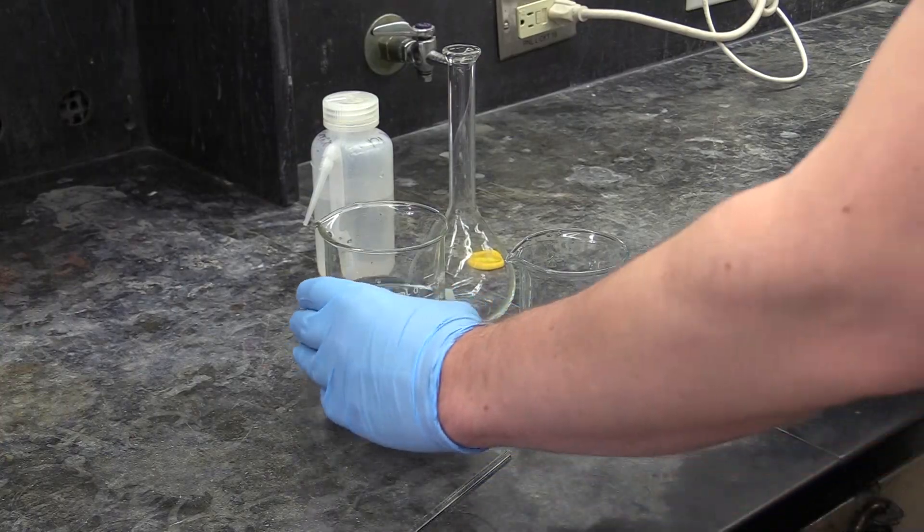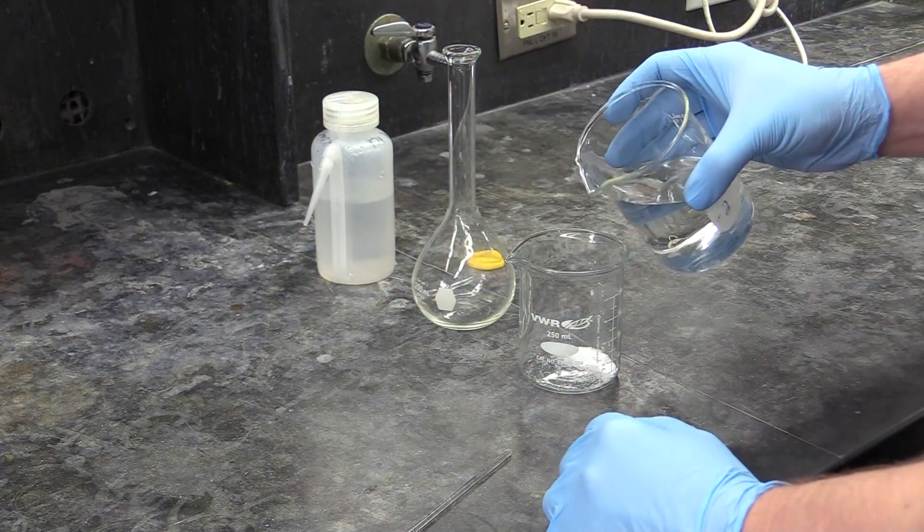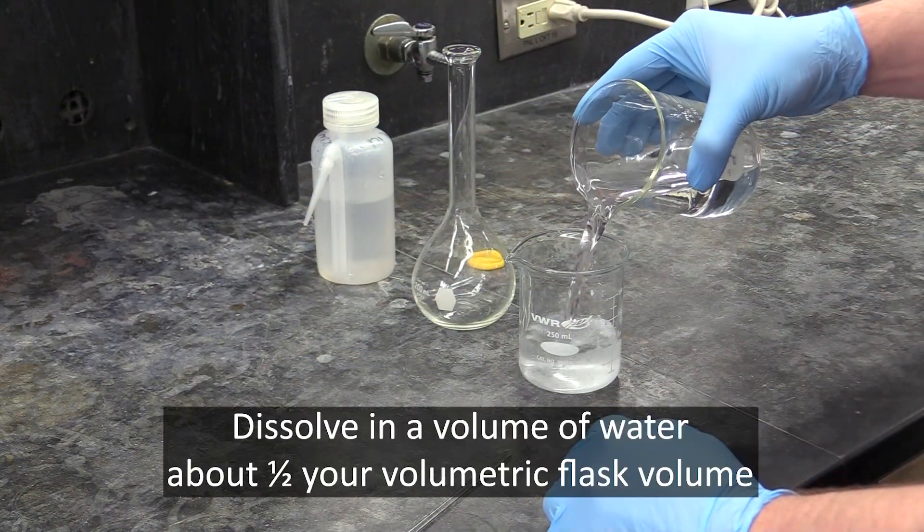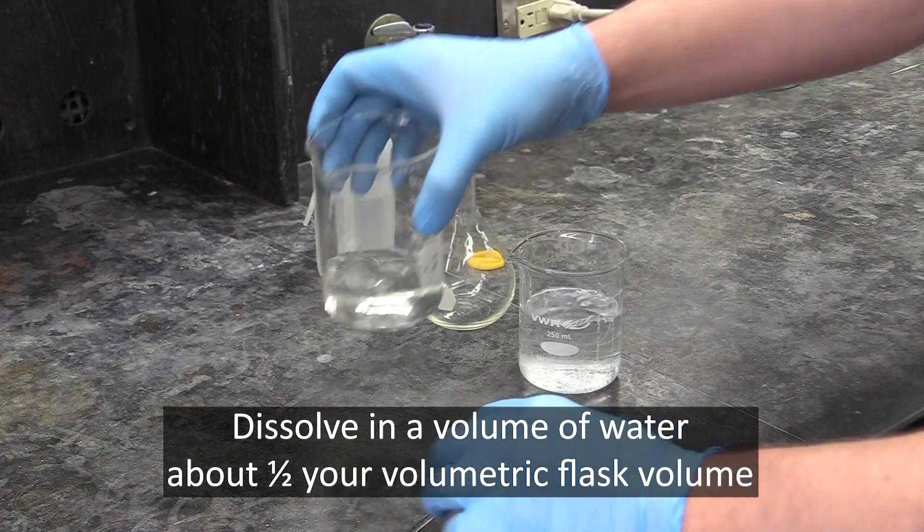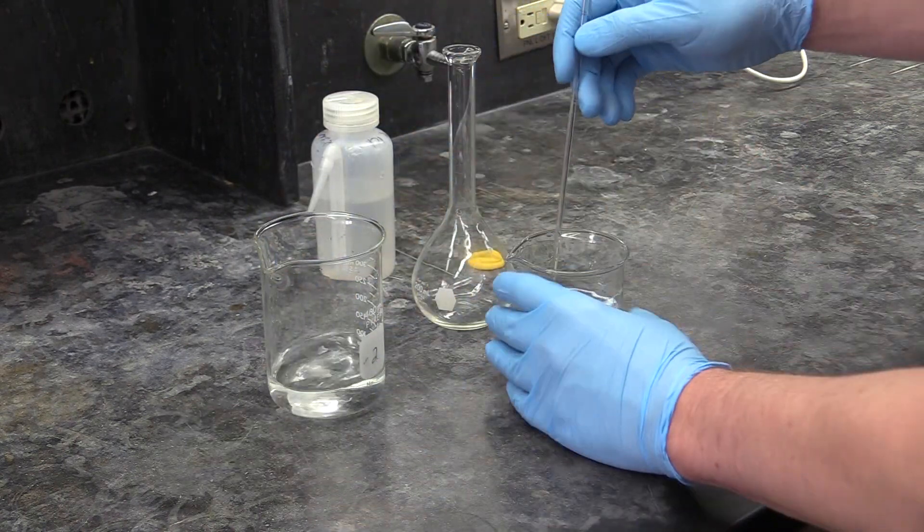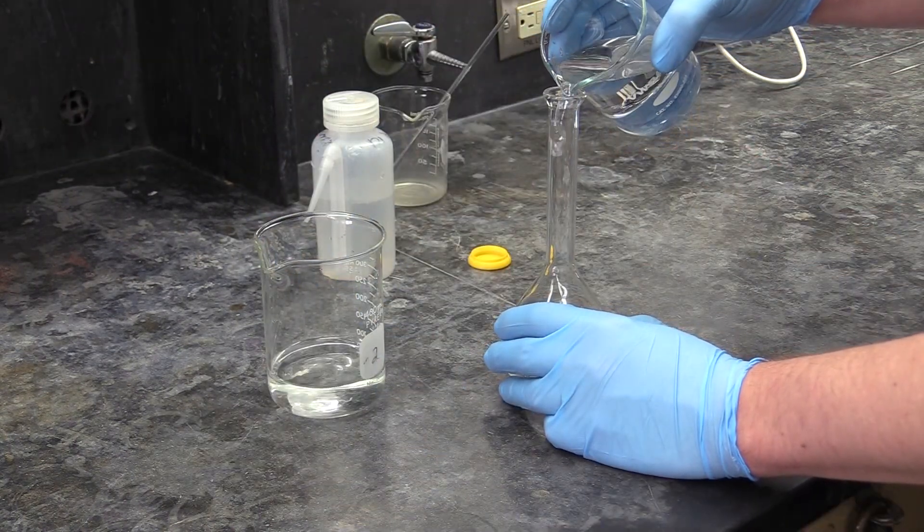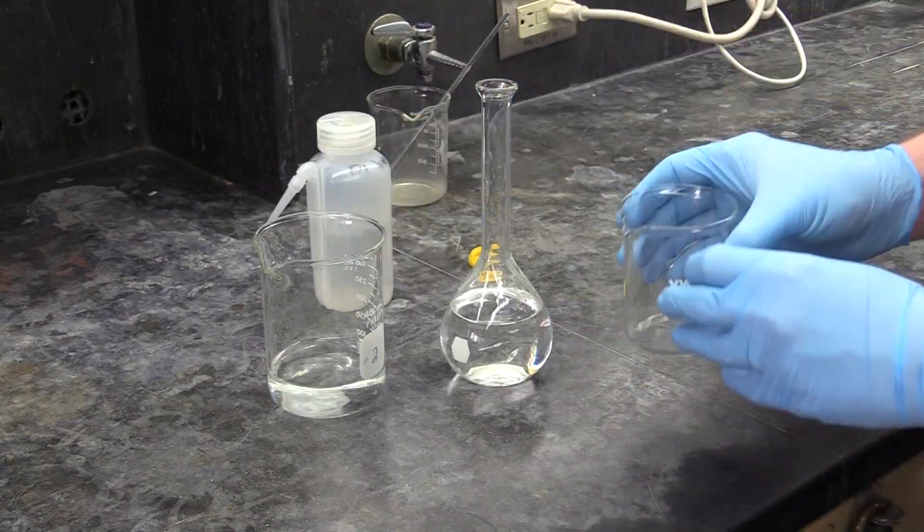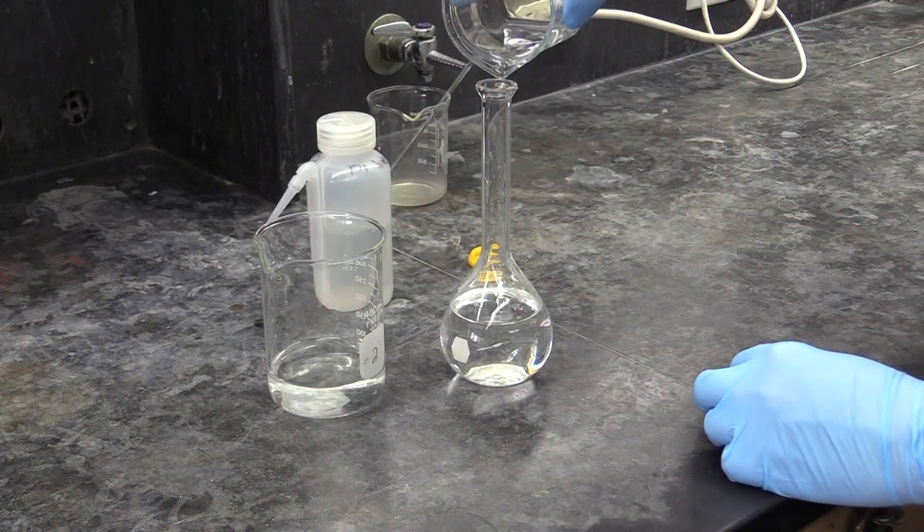You'll then dissolve the acid in some water. For the amount of water, you want to use roughly half of whatever your volumetric flask volume is, or maybe a little less. After the acid is dissolved, pour it into your volumetric flask, then rinse the beaker out with a little water and pour this rinse water into the flask.